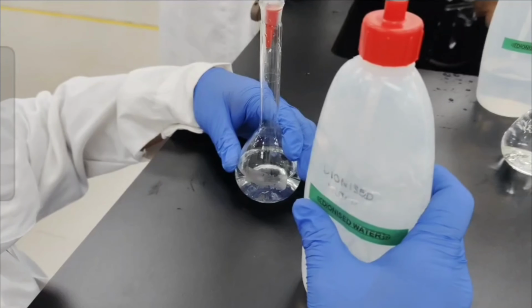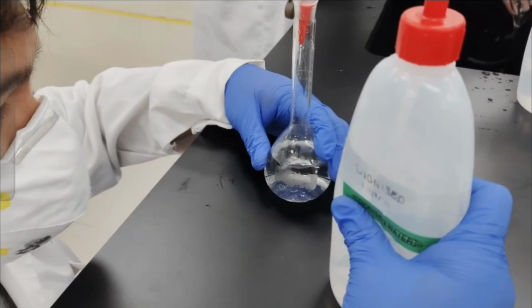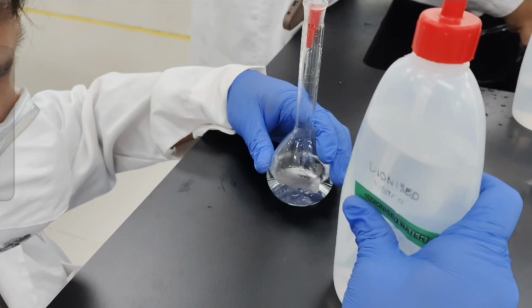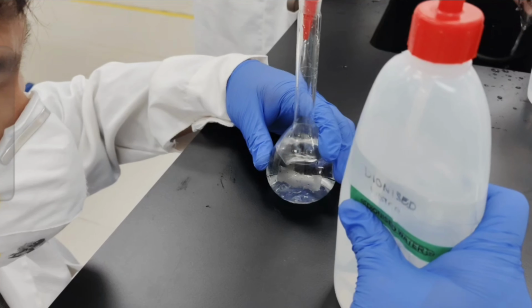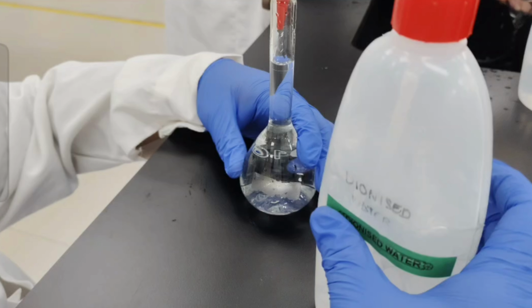We put 2 milliliters of stock solution into the 100 milliliter volumetric flask that is already filled with a bit of deionized water. Then we fill the volumetric flask with deionized water until it reaches the mark. After that, we close the volumetric flask and shake it well to get homogeneity.